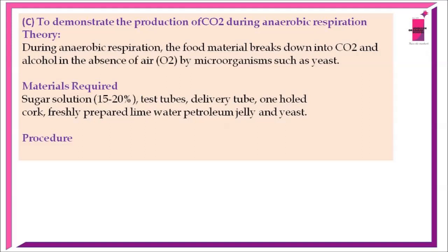To demonstrate the production of carbon dioxide during anaerobic respiration. Theory. During anaerobic respiration, the food material, that is glucose molecule, breaks down into carbon dioxide and alcohol in the absence of oxygen by microorganisms such as yeast. This type of respiration is called anaerobic respiration.